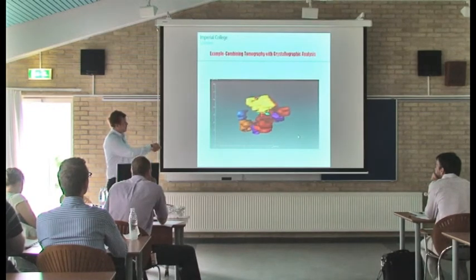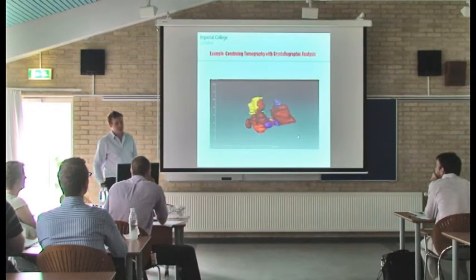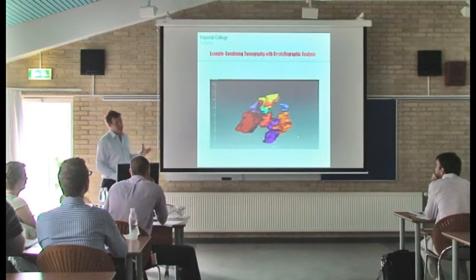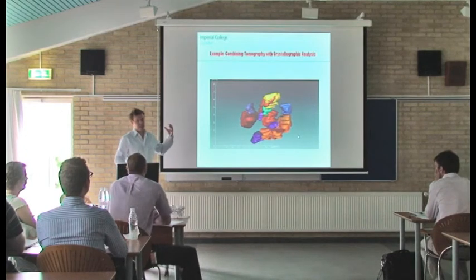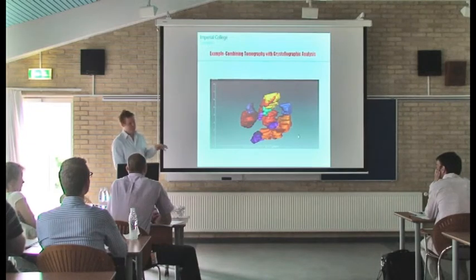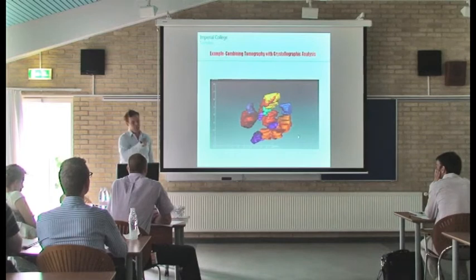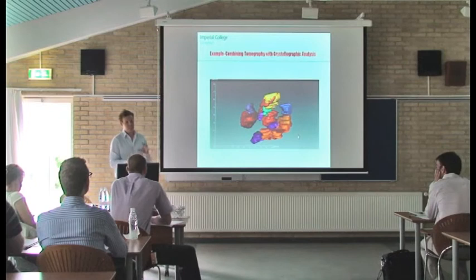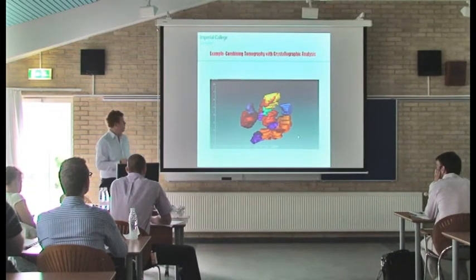But one thing that you can see is that we've got pretty coarse Z-plane resolution. So we have extremely rectangular voxels in this instance. That's just because the time it takes to collect the EBSD maps is so long that we decided to sacrifice a little bit of the Z-plane resolution just to get the proof of concept studies done. And obviously, given time and sufficient tenacity, you could try and achieve cubic voxels. I think that's certainly possible.